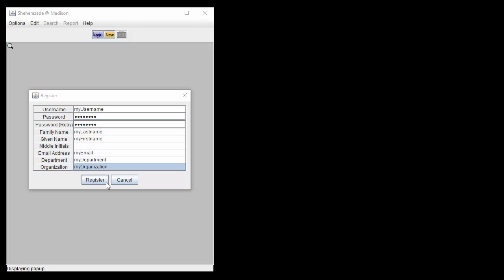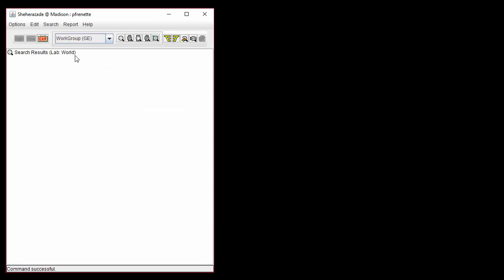Users register during their first access to Sesame. Every user is by default assigned to the World Virtual Lab. The World Lab is the part of Sesame that is visible to all registered users, or in other words, the Virtual World Lab and the data in it are public.